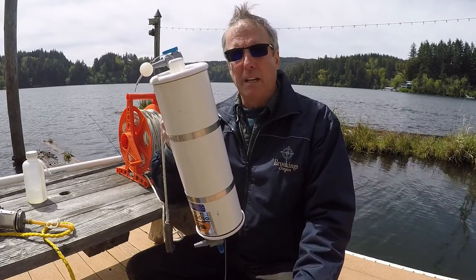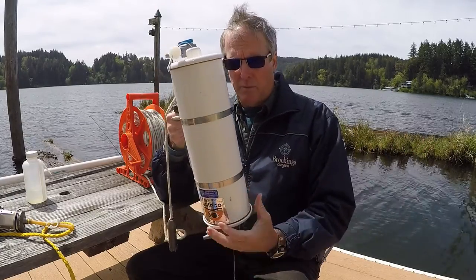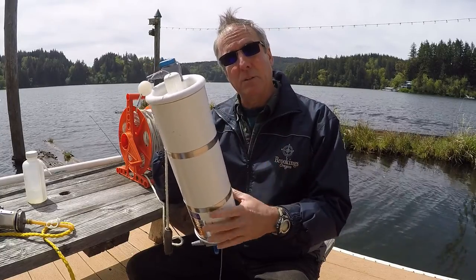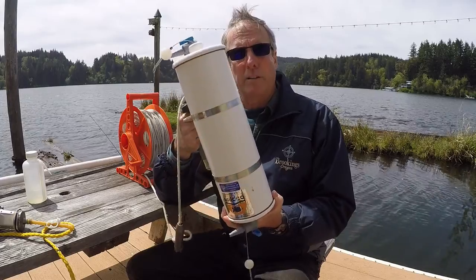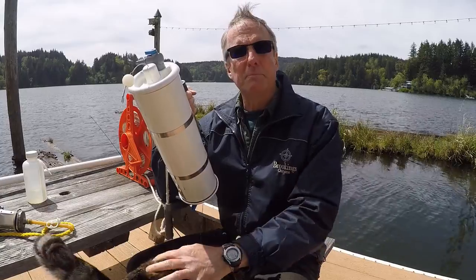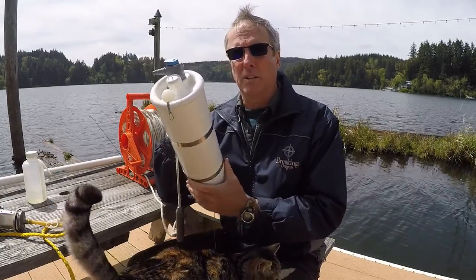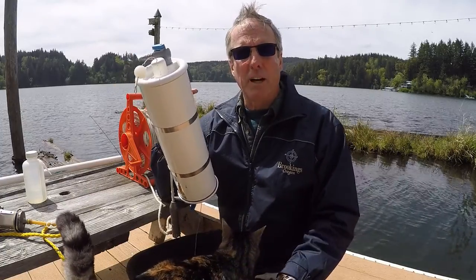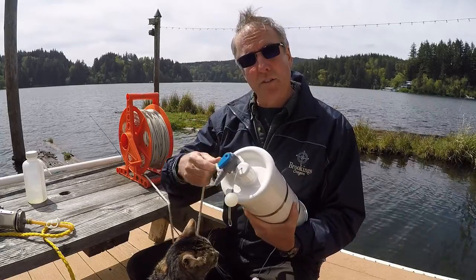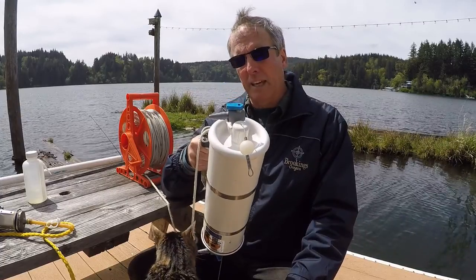We talked a little bit about that thermocline layer, so maybe you want to take a sample of water that's within that thermocline, or very commonly you want to take a sample of water very near the benthic surface, right where you may have some problems with your low dissolved oxygens and your phosphorus and nitrogen levels may be elevated down there due to that. And that's where the Van Dorn bottle comes in really handy.